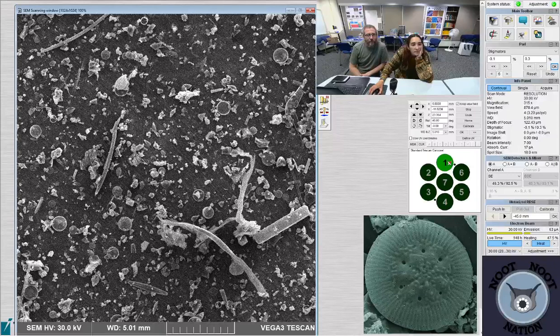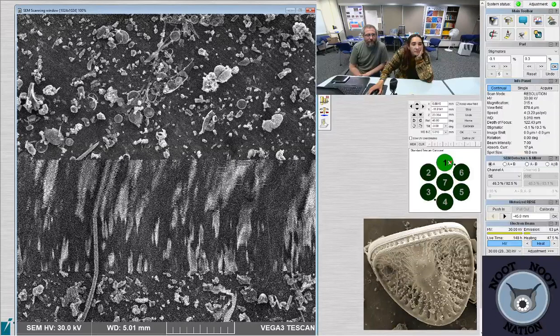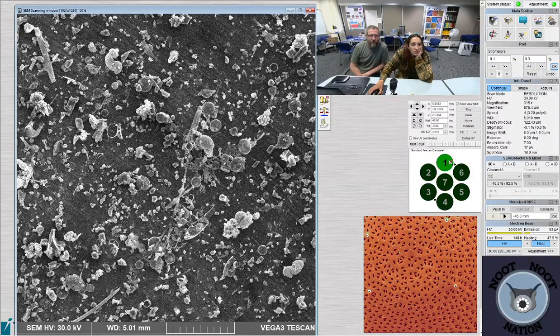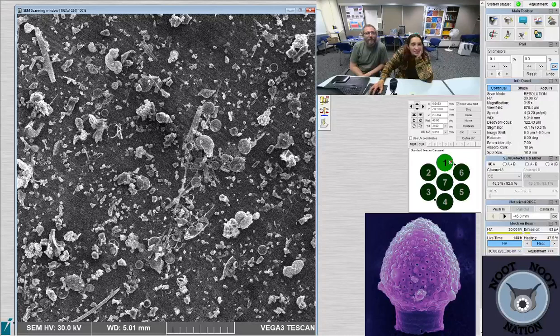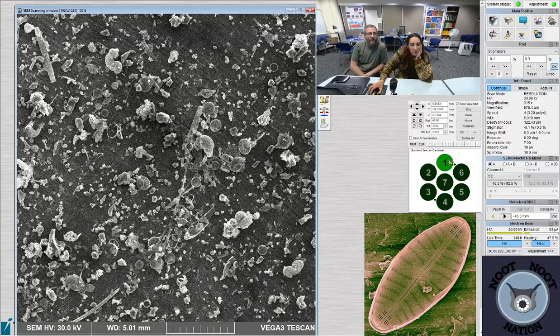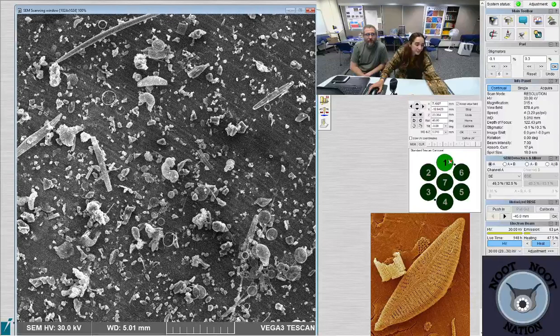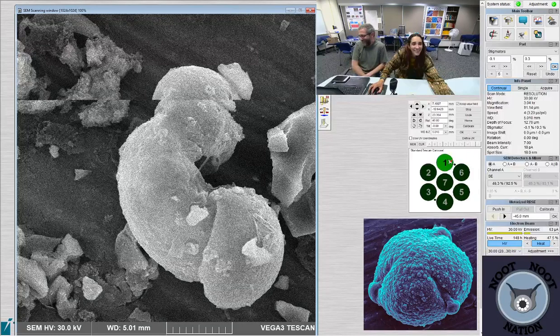Sponge spicule. Yeah. Another one. Pollen. This one? Yeah, and that other one at 11 o'clock. No, there's three of them. Oh, yes, there's four of them. They're in a row, actually. Maybe we can get a nice picture. Which one's the prettiest, this one or this one? I think that one or that one. I don't know, it's pollen, they never look too pretty. Maybe not so close. Like that.